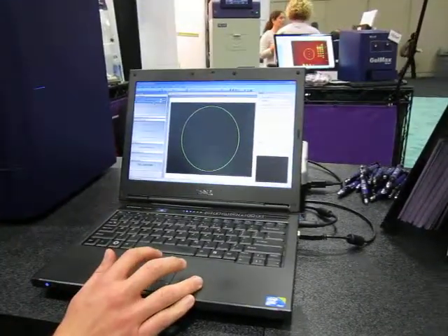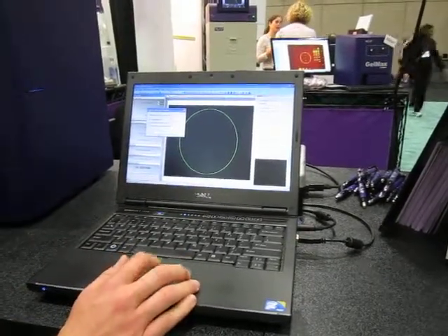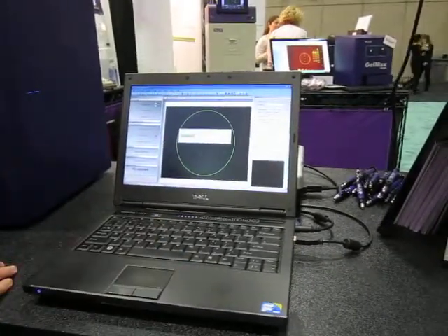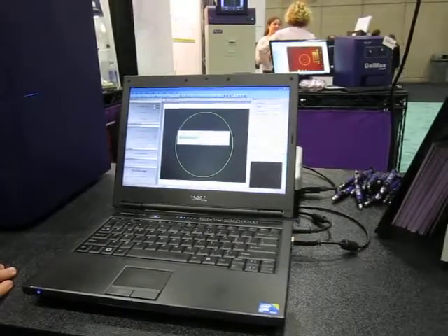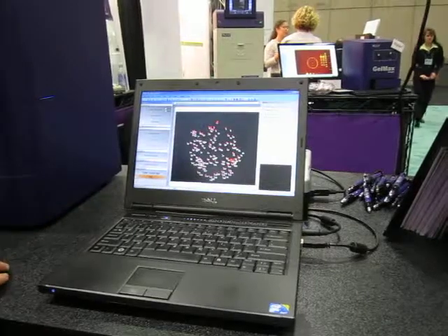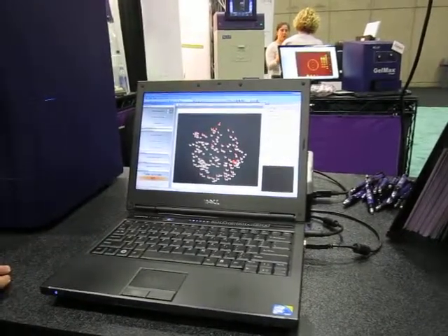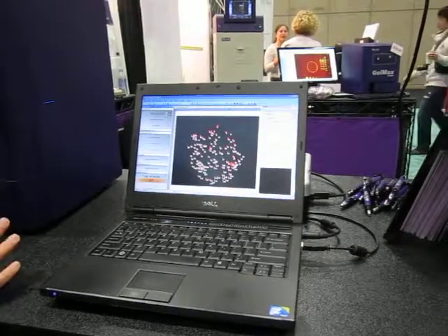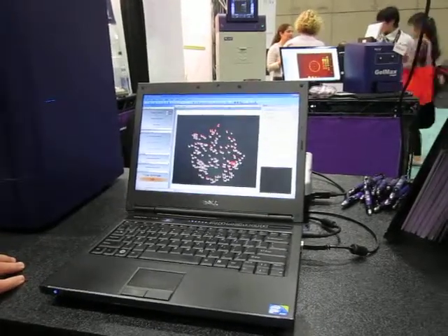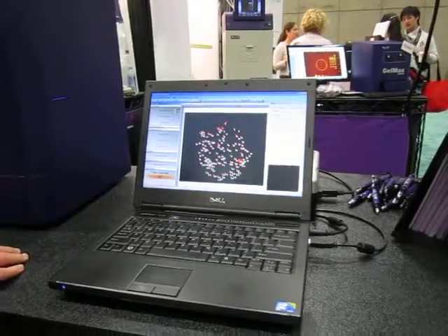Simply click on Start Colony Count and we'll go ahead and do an automated colony count. The system will take about ten seconds. Once the counting is complete, you can see all the different areas of the colony that have been counted. If you need to, you can always add or remove colonies, or merge or separate colonies. Right here we're happy with the results and we can see that we've come up with a total of 143 colonies.